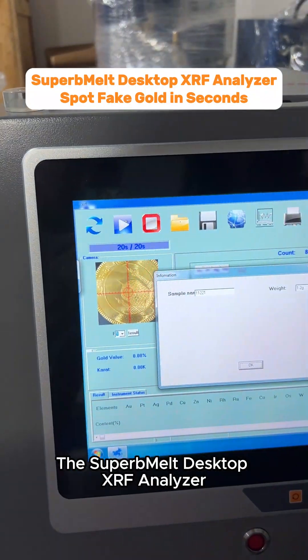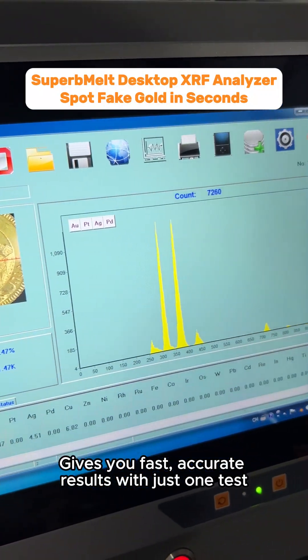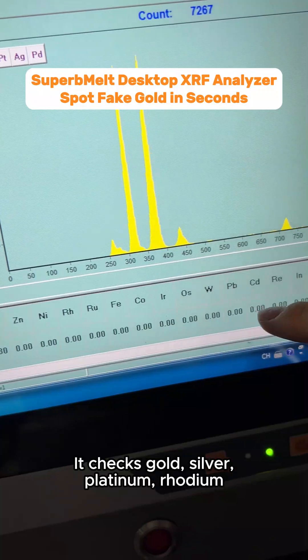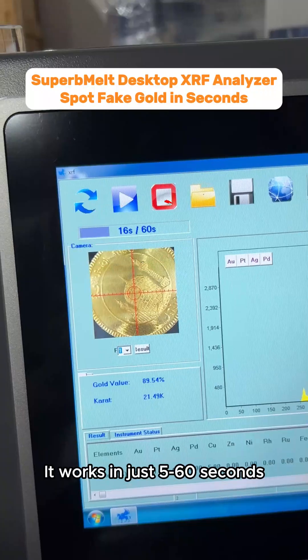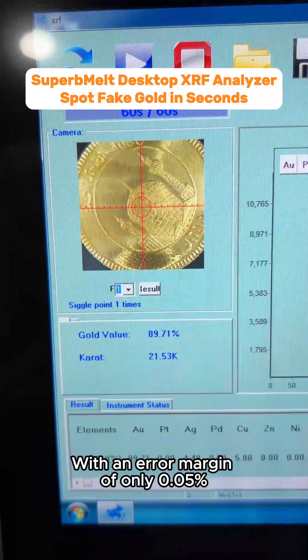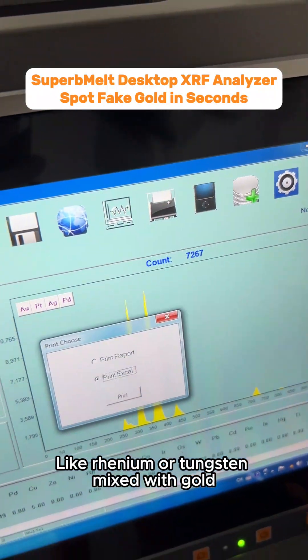The Superb Melt Desktop XRF Analyzer gives you fast, accurate results with just one test. It checks gold, silver, platinum, rhodium, palladium, and 74 other elements — from potassium to uranium. It works in just 5 to 60 seconds with an error margin of only 0.05%. Plus, it can spot impurities like rhenium or tungsten mixed with gold.